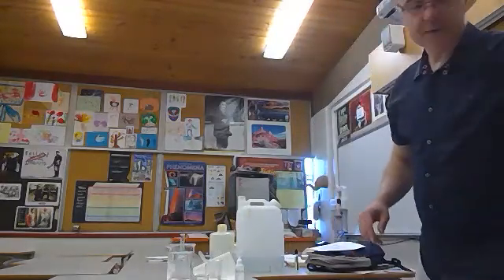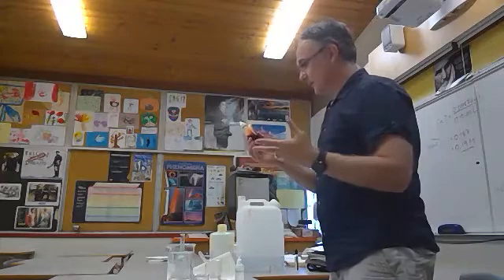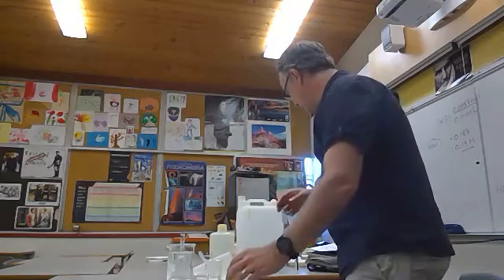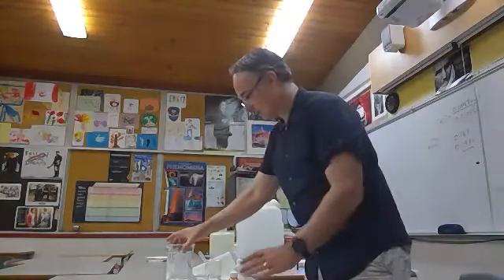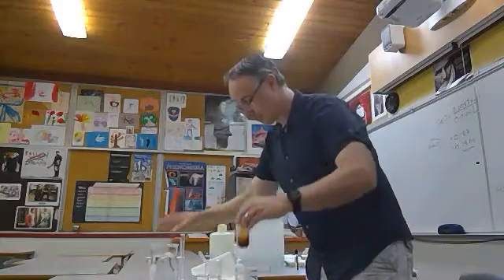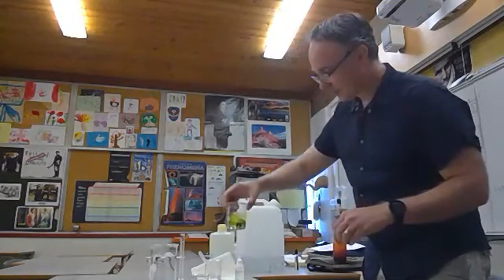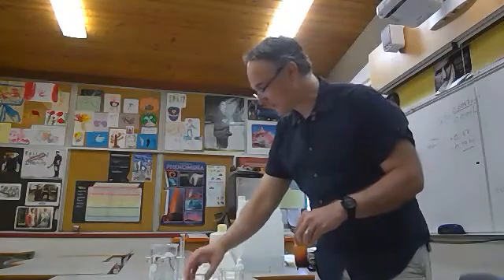So another chemical we can work with is universal indicator. So this chemical here stains your clothes when working with this stuff, but also stains desk surfaces and your fingers. But it actually has about 10 different indicators in here. It gives you a spectrum of colors you can actually witness, in just one chemical. So if I grab a beaker and I pour just water into it, and I add some universal indicator, it's kind of red when it goes in, but for water, it turns into kind of a greeny color. And so that's sort of around pH 7.